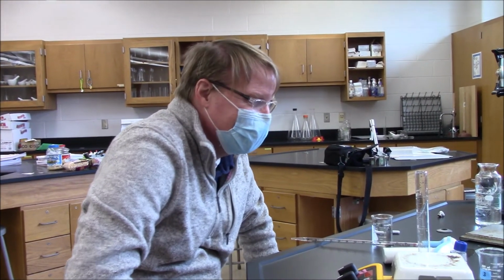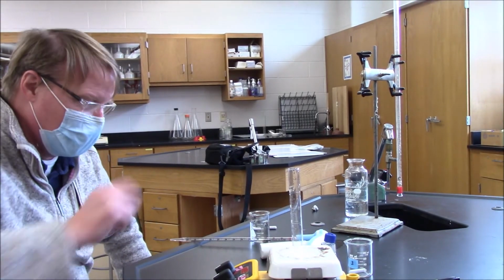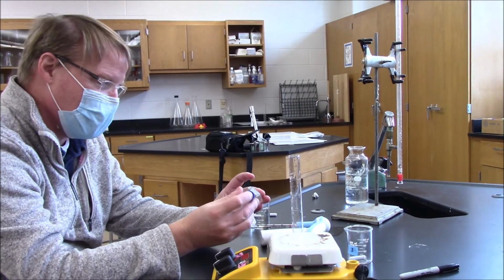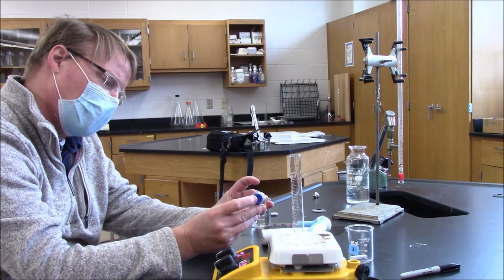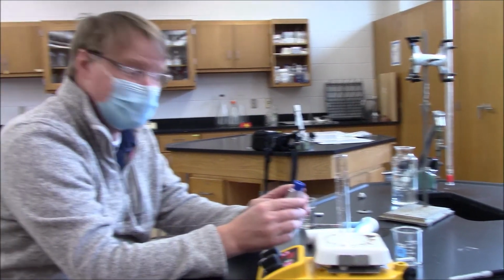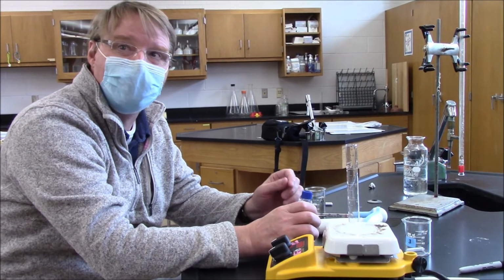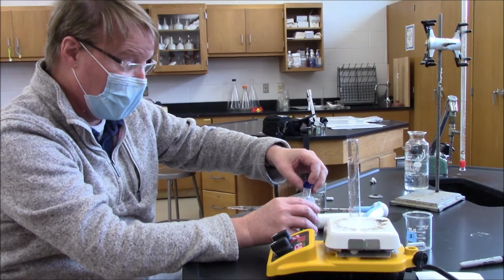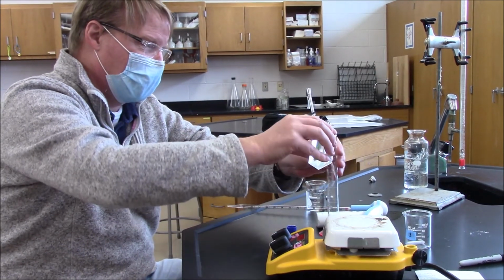All right, so Mr. Joyce, can you pick up the plastic bottle and tell me what the label says? Okay, this plastic bottle says water number 3 Bluebell. All right, so we're going to analyze Bluebell water here. Can you go ahead and open it and pour it into the graduated cylinder? Okay, how much am I pouring in? The whole thing.